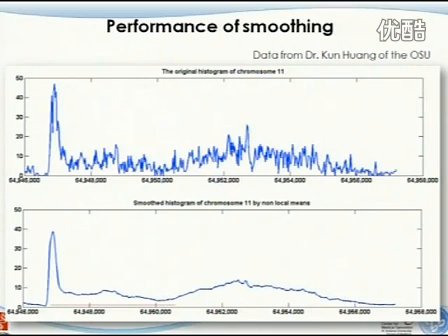Right? So when you see these signals, when we look at the different noise distributions, there's something called white noise. That's something we see a lot, which means they really don't follow certain patterns, but their intensities are just random.